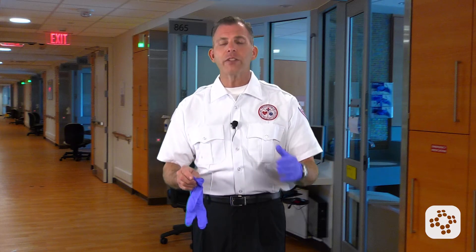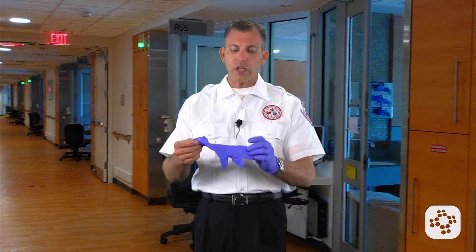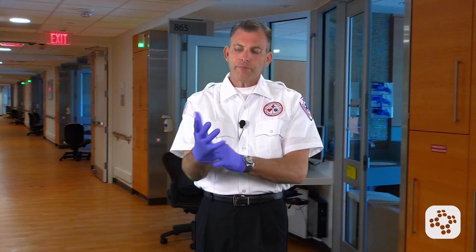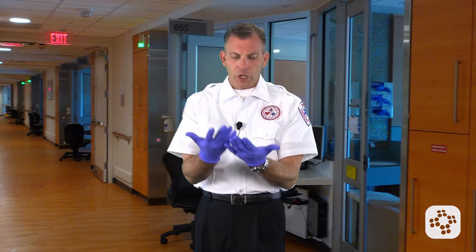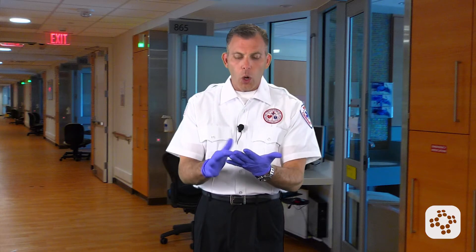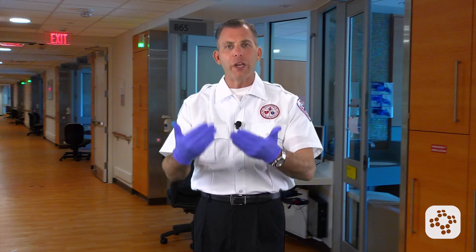If they have extra-extra-large hands, you need to get a box of extra-extra-large gloves. Giving them a one-size-fits-all that rips every time they put them on is not appropriate. So we're just going to put these clean gloves on the normal way. We're going to inspect the gloves to make sure there's no cuts, no holes — nothing obvious that's going to ruin the integrity of this barrier.